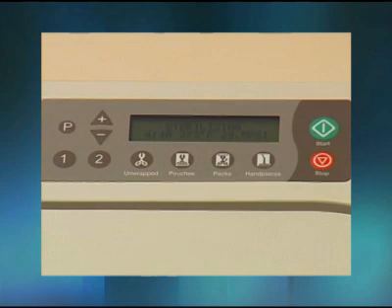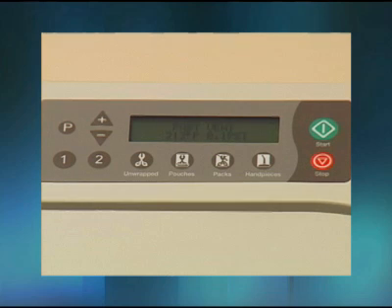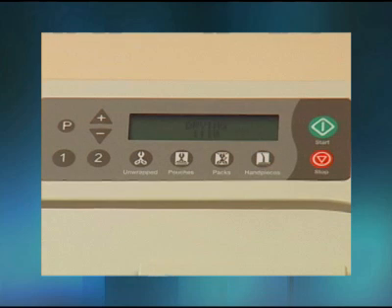Sterilizing is displayed during the sterilizing phase of the cycle, along with the autoclave temperature and pressure. The sterilizing time is displayed and digitally counts down the remaining time in the sterilizing cycle. Venting is displayed when the steam is being released from the chamber. The door automatically cracks open about 1 inch once the steam has been released. Drying is displayed during the drying cycle. When the autoclave has completed the cycle and the sterilized articles can be removed from the autoclave, the phrase "Dry Cycle Complete" is displayed and the autoclave automatically shuts off.